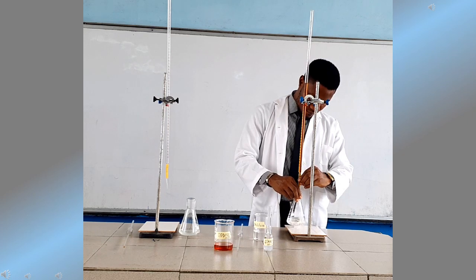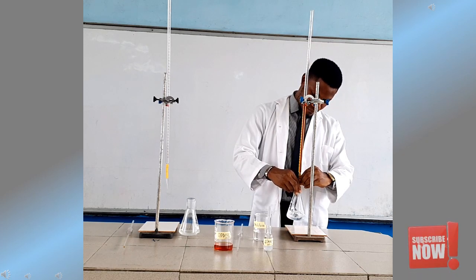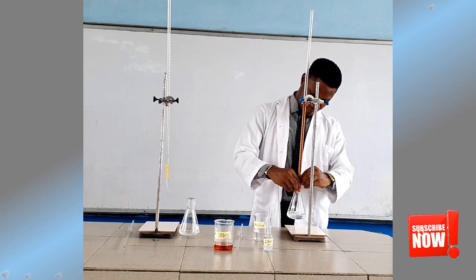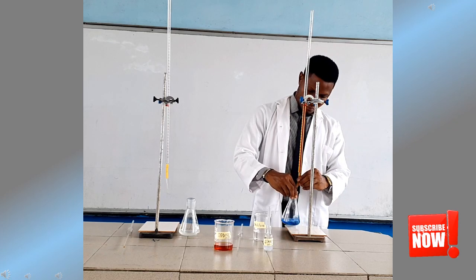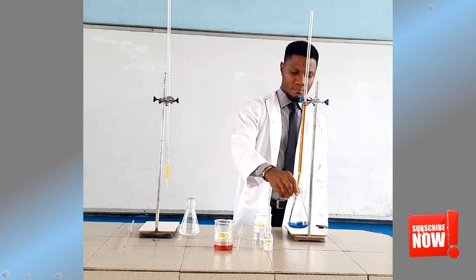The titration continues, or let me use the word, it proceeds until the endpoint is reached. How do we know the endpoint? There would be a color change. And how do you know this color change? What will be this color change? Let us watch and see. Wow! Now we arrive at the end point and our color change is blue.